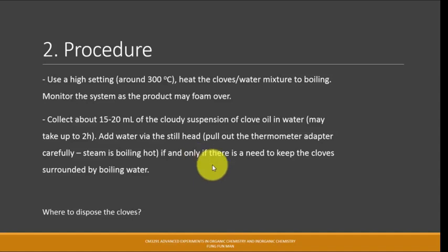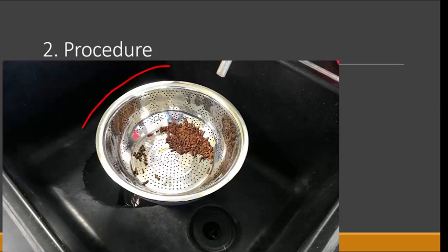Top up. At the end of the day, how do you dispose of the cloves? Solid, right? Brown solid suspension. Do we dispose of it in the waste bin, trash bin, or what? You should transfer it, as shown in this picture, through the strainer that we place in the basin, so that we collect the solid and then we discuss it later with the custodian of the lab.